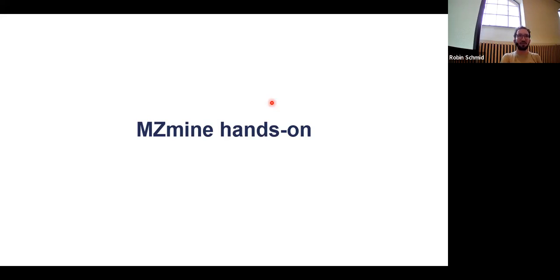Generally, I think it's very important to just try out the different tools, and I know that they are very actively developing it. If you're already proficient with R, it's very nice because you're already in that system. It's very easy to push data around to do the downstream statistical analysis. With MZmine, we're very much not focusing on statistics, because we know that R and Python are very flexible and very easy to use. So we rather export the results and pipe them into other tools, and then maybe import the results back.